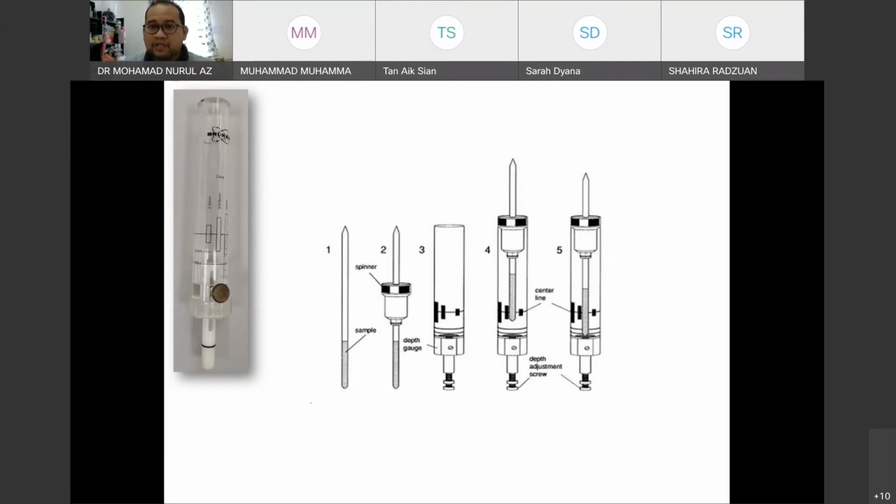Our concern is that when the tube goes into the probe, it will spin. If the spin is not correct, sometimes it will hit the inner layer of the probe, and it will be broken. It has happened several times. So make sure you have the correct level for the NMR samples, and after that you put it inside the probe in the superconducting magnet.